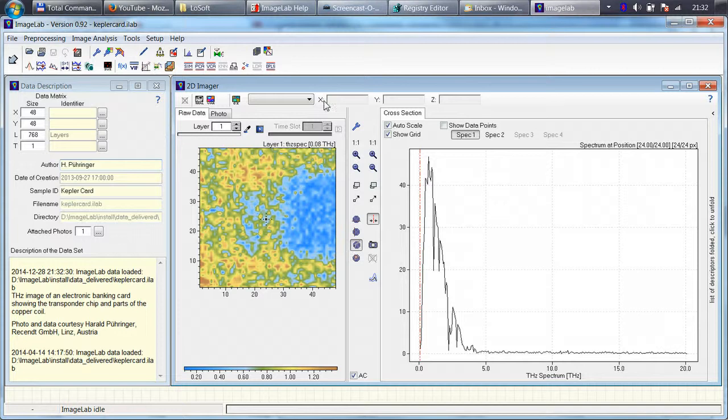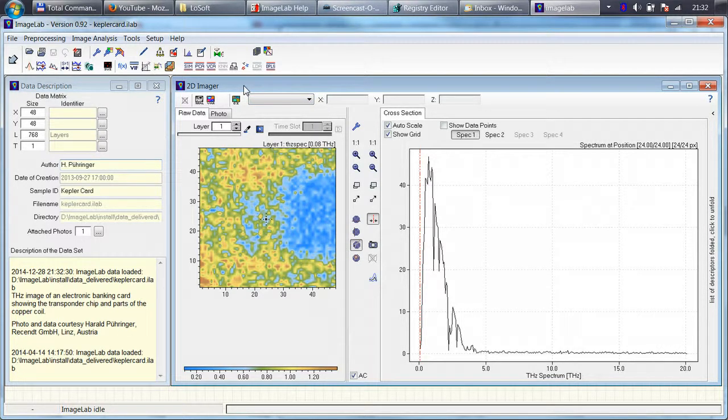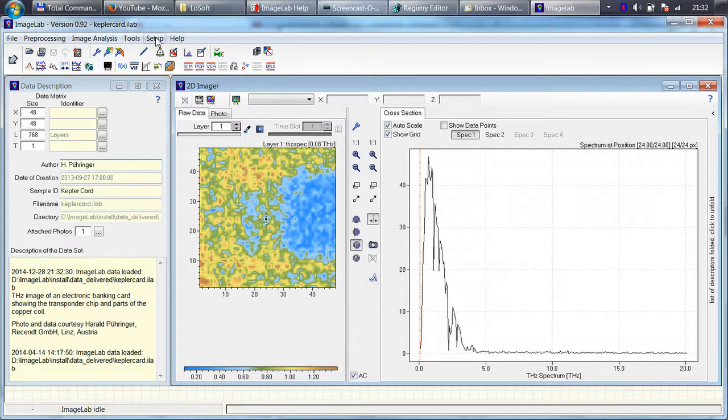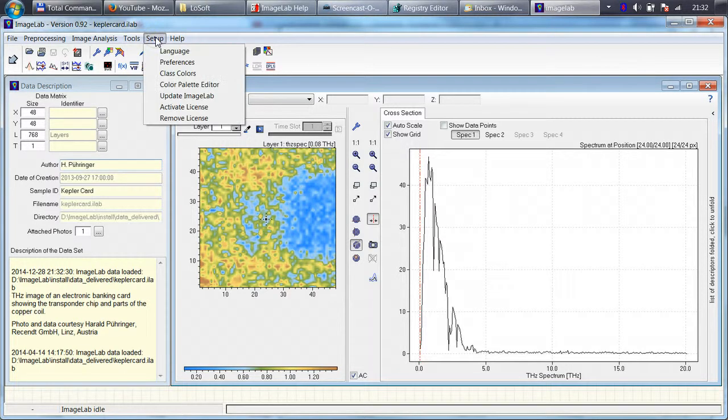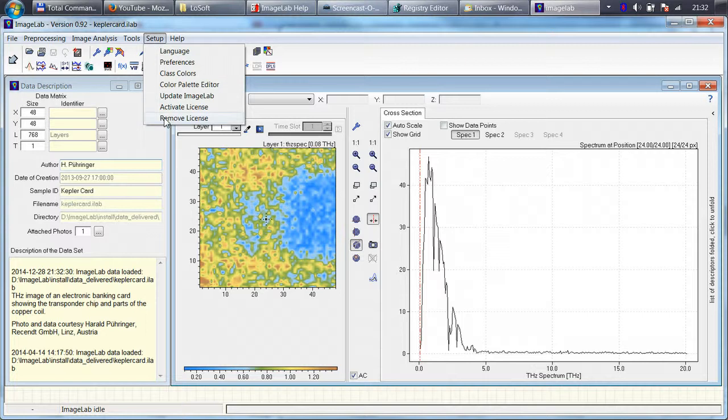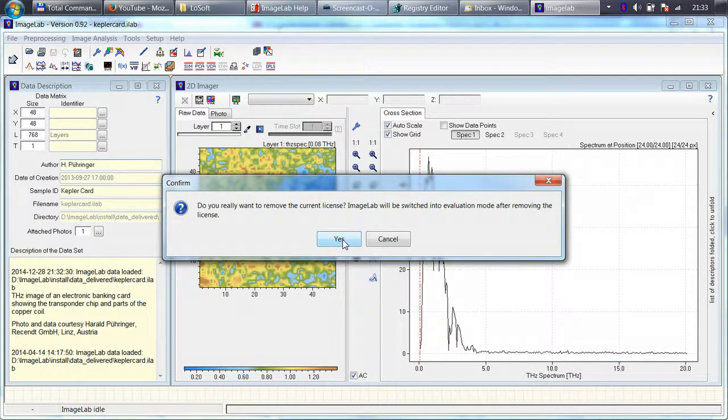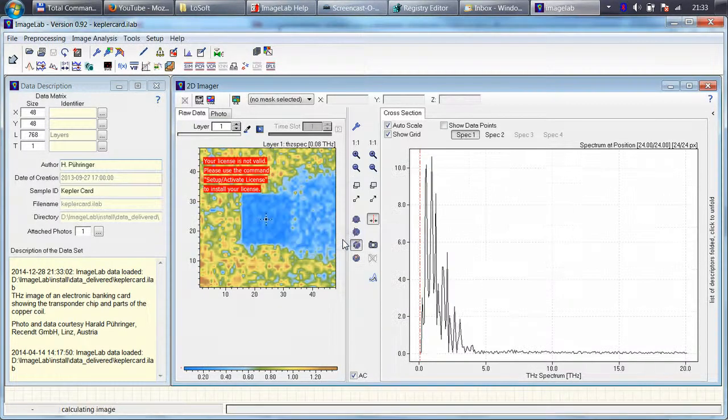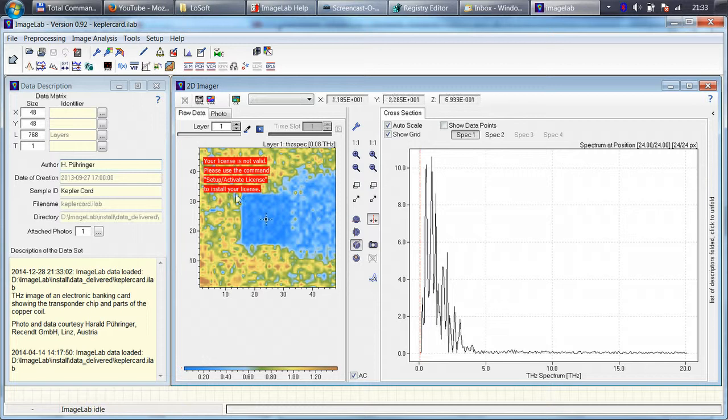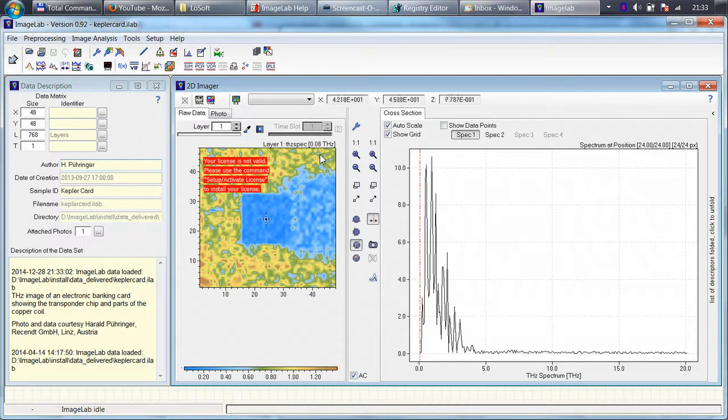Of course, just as a remark, if you, for example, installed your license on a foreign computer and you want to remove the license, you could also remove the license just by clicking Setup, Remove License. And if you confirm this question, then you get rid of the license and ImageLab is back in the evaluation mode.